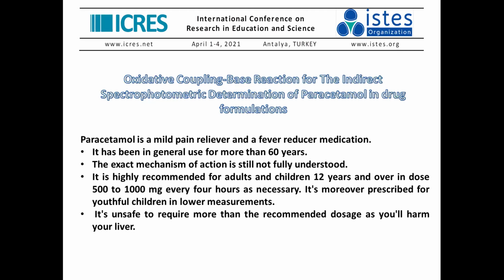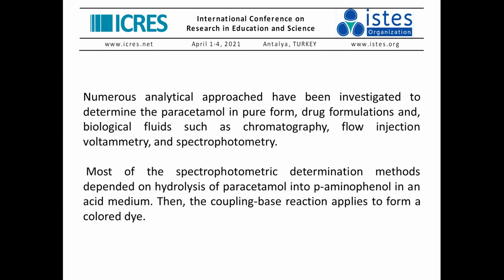Therefore, determining the concentration of paracetamol is very important, especially in drug companies. Many analytical approaches have been investigated to determine paracetamol in pure form or in formulas, and also in biological fluids such as blood or urine.